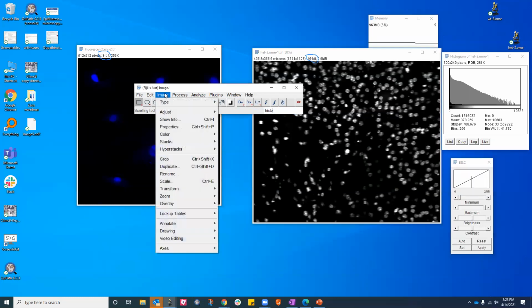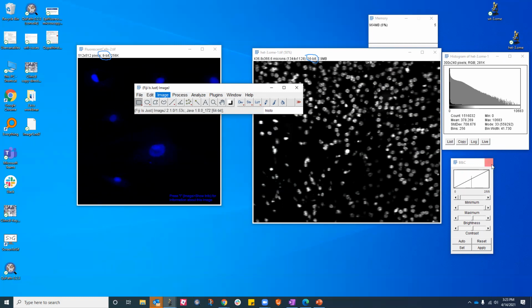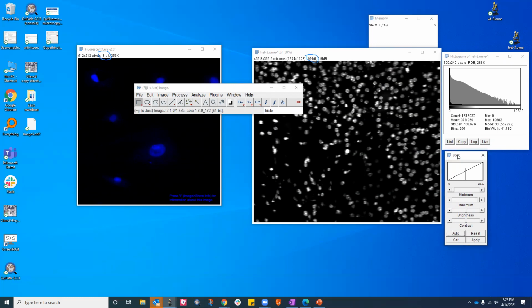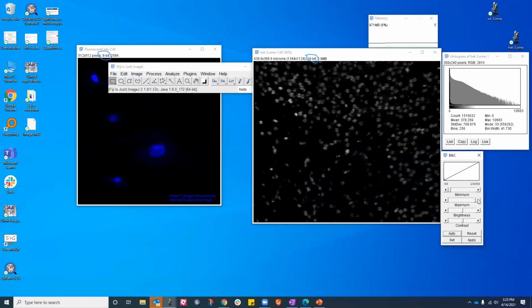And it also said the shortcut for brightness contrast is Shift Control C, okay? And I kid you not, this is very, very helpful. You will be using this shortcut way too many times than you can think of. So I'm going to close this and do Shift, Control, and C, which brings up the brightness contrast. Now I'll go back and click on this image, and it says 83 to 3904. That's what the brightness contrast is set to.